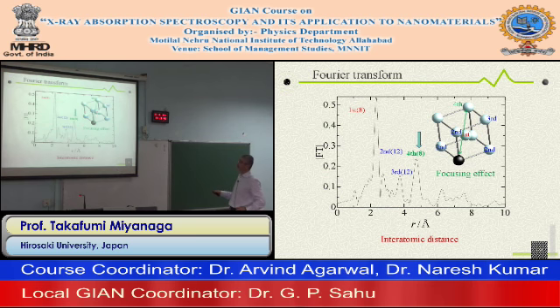The atoms are arranged in linear systems, so the photoelectrons are focused by the center atoms, and the forward scattering amplitude is very large: 1, 2, 3, 4. So this peak should appear with very large intensity. This is a typical example of the BCC system, iron, iron rhodium, or some metallic systems.